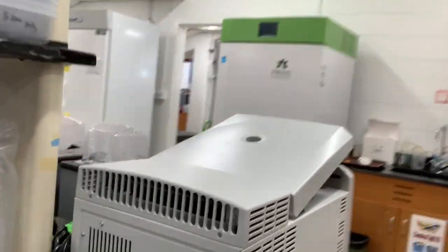During this incubation, you're free to do other things. You might catch up your lab notebook, but there are a couple of things that I would recommend doing if you are going to proceed with the cleanup at the end of the incubation. The first is that I would recommend chilling the centrifuge. So we're going to use this centrifuge that's by my bench right here.